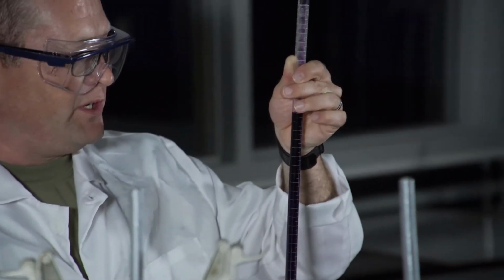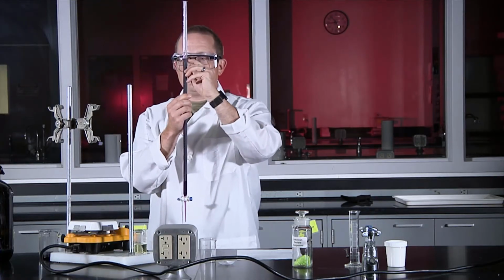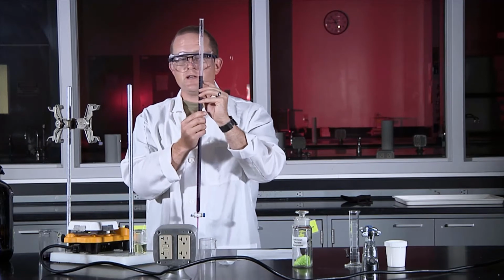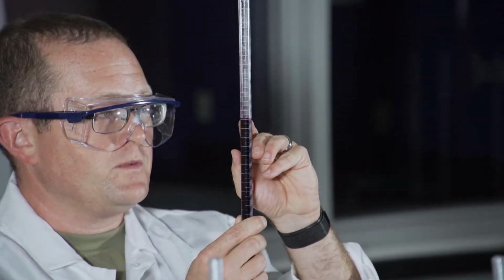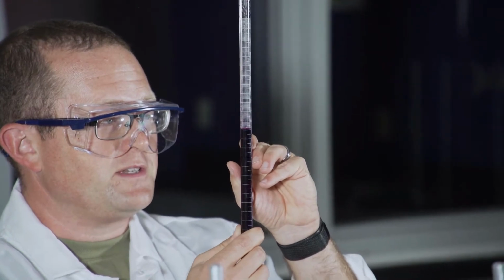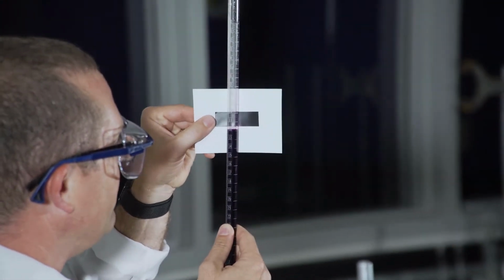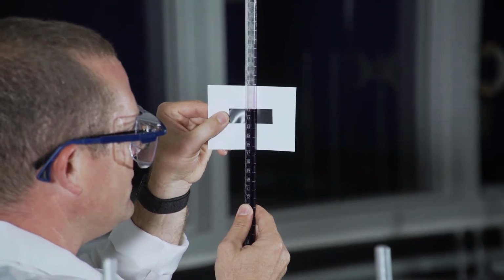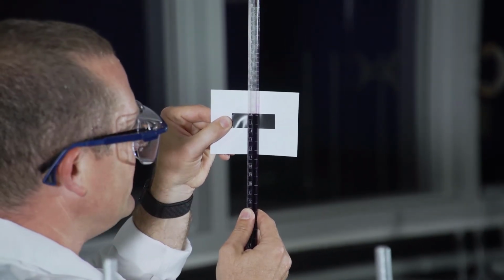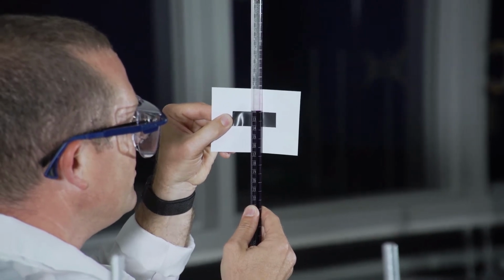And that'll be good. You want to note that volume. It doesn't matter what the volume is as long as you know exactly what it is. For us, you can actually use this card to check the volume. You can see the contrast between the white and the black helps you find the bottom of the meniscus a little bit better. So for us, that's about 11.83.